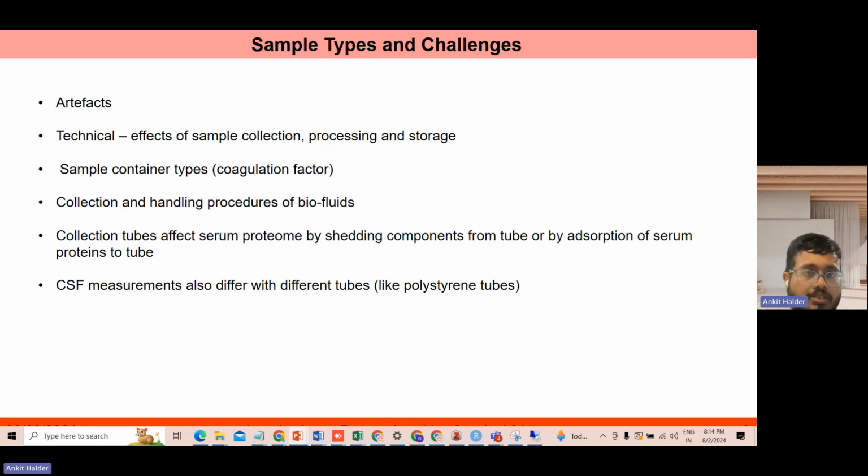Then you would be seeing variation. For example, if you have extracted proteins from three biological replicates of a control state and three of a disease state, 3 and 3, that is 6 gels, and now if you want to compare, you will see that there are many artifacts. That artifact means the changes.